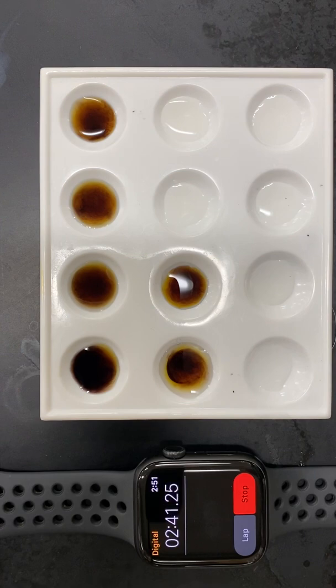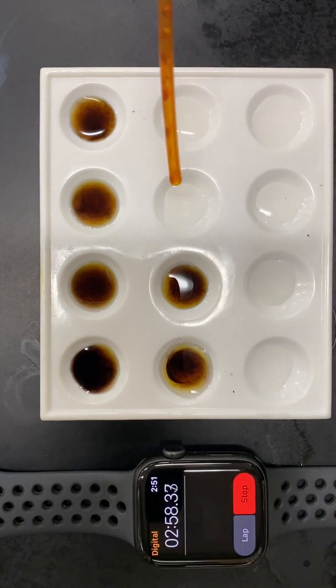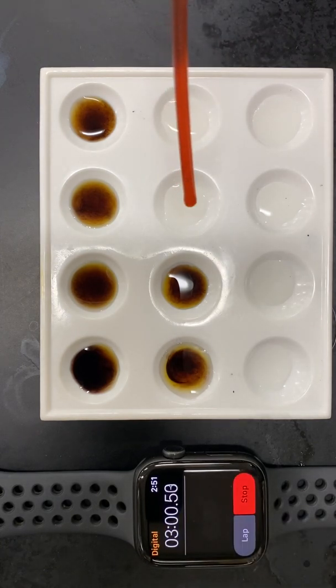And what's happening here that we have to think about is the fact that the enzyme itself is working on breaking the starch down. And when it's working on breaking the starch down, what we end up with is eventually some smaller simple sugars.